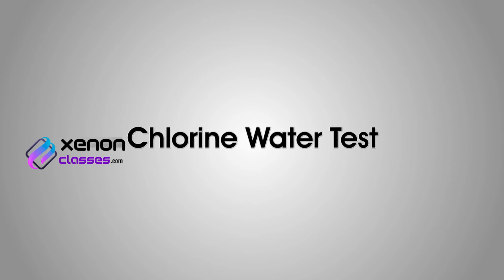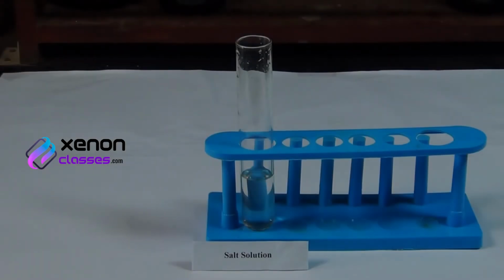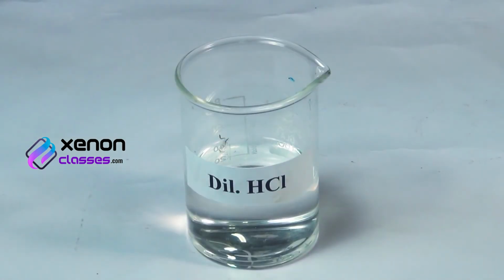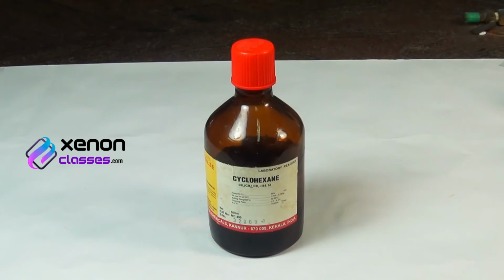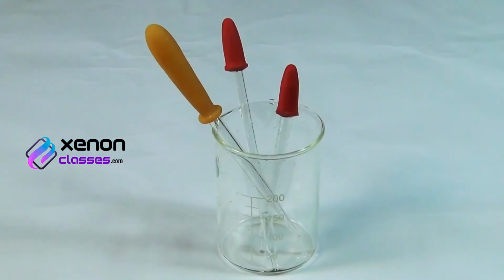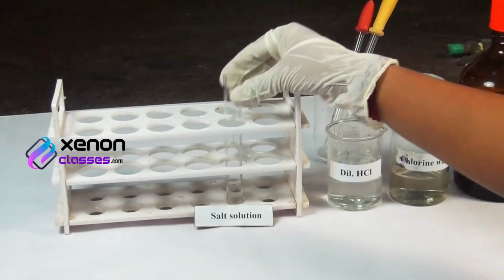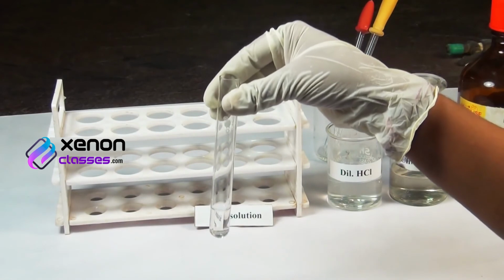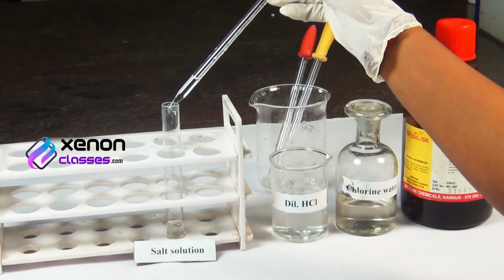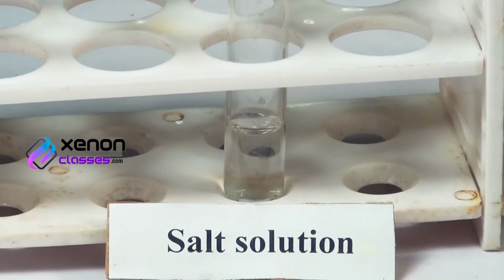Chlorine water test. Materials required: aqueous solution of the salt, dilute hydrochloric acid, cyclohexane, chlorine water, test tube and droppers. Procedure: take a small portion of aqueous solution of the salt in the test tube. To acidify the aqueous solution, add a small volume of dilute hydrochloric acid using a dropper.